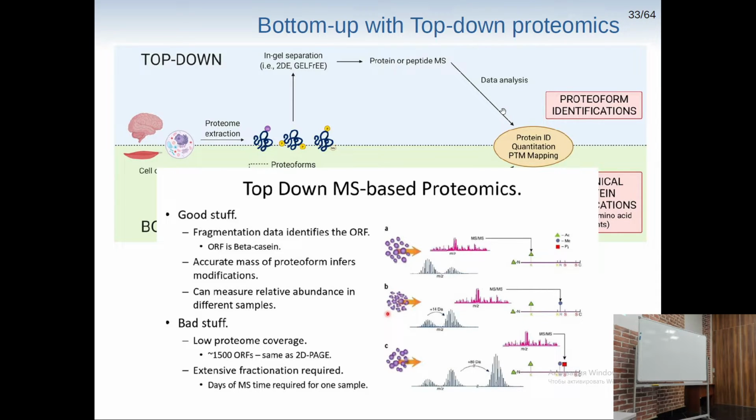So, if you will have any proteomics work, then I could almost guarantee that you will work mostly with the bottom-up approach. Ten years from now, probably there will be some modifications of this top-down method, which allow you to streamline it and do the same with less time. And of course, this top-down approach allows you to get more information on the proteome.